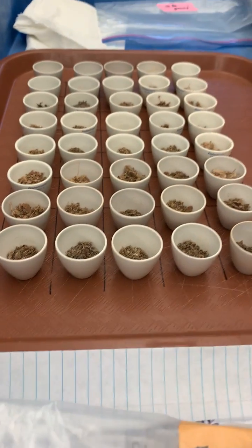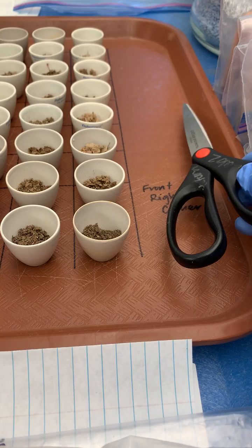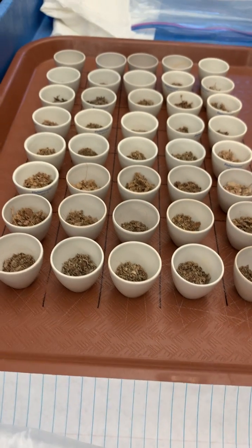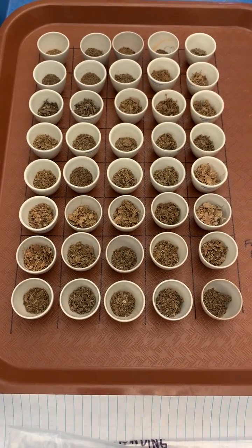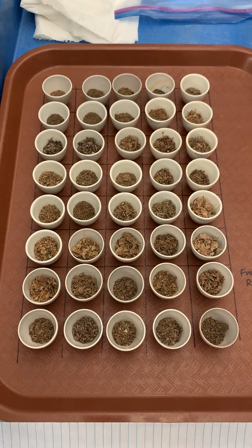You can see these little crucibles — here's a pair of scissors for size. I lay them out — this is 40 samples — in a particular order so that I know exactly which sample is in which crucible. Crucibles are numbered.